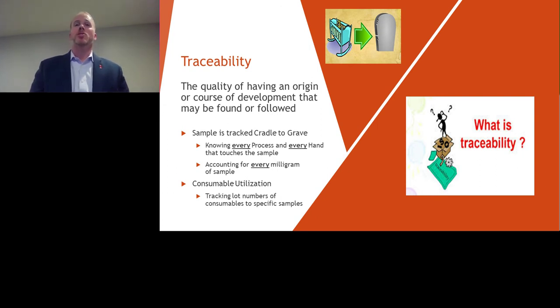And then if there is an issue with that, that may cause some issues in your data, you would be able to flag that information and then talk with your client and decide what needs to be done. But that whole concept of traceability, it's really for your protection and the protection of your lab and everybody in your lab, so that if questions arise or something becomes missing or is lost sample-wise, you would be able to backtrack and trace to see where that sample was and what happened to it.